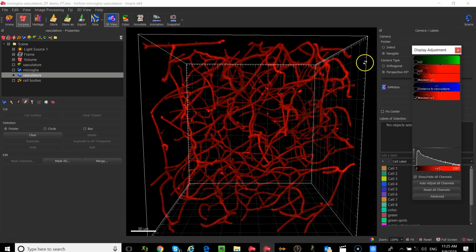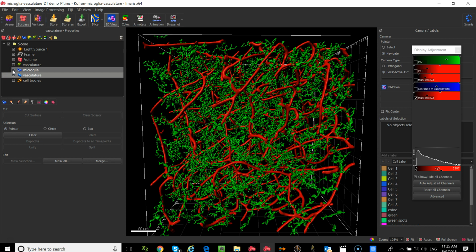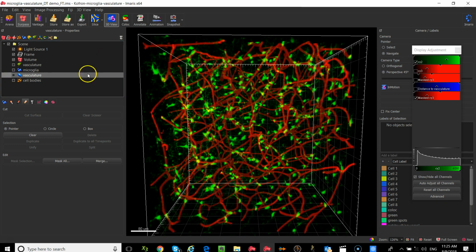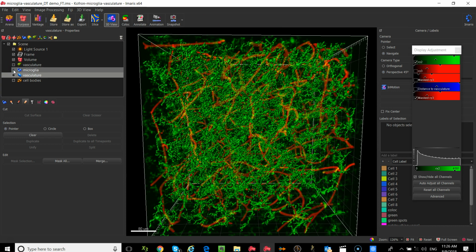The other feature I wanted to show you is regarding distance information. You'll see that I have not only blood vessels, but I have microglia. I know they didn't look that crazy before I had the intensity turned down on these microglia, but let me show you what these guys look like. In this particular data set, they happen to be extremely bushy. There's a lot going on and there are projections everywhere. Even though the display wasn't showing them, I used the surface segmentation to pull out that very fine, dim projection information. So what we have here is a surface model that represents those microglia.